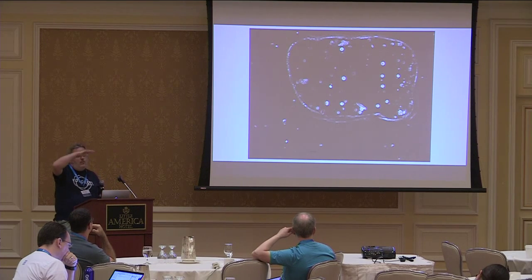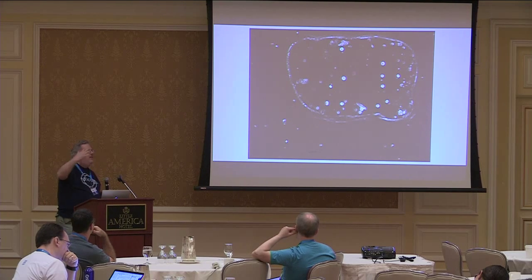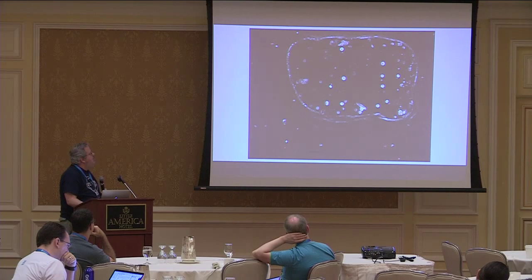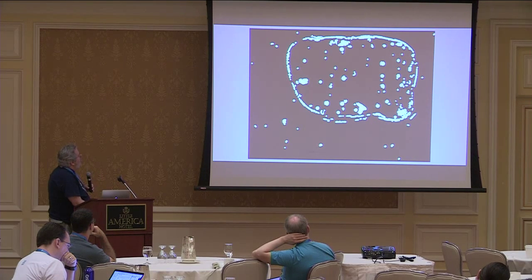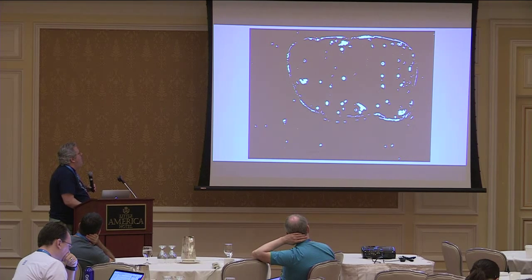And what it does is it tries to do that such that the variance between all the pixels in the foreground and all the pixels in the background is maximized. It's like a one-line command in MATLAB to do that. So then you end up with this, and we have all the cells, but we also have a lot of that wall still there. So what I did then was just do another erosion after that to get rid of some of the chunk. And this is something you actually work with pretty well.